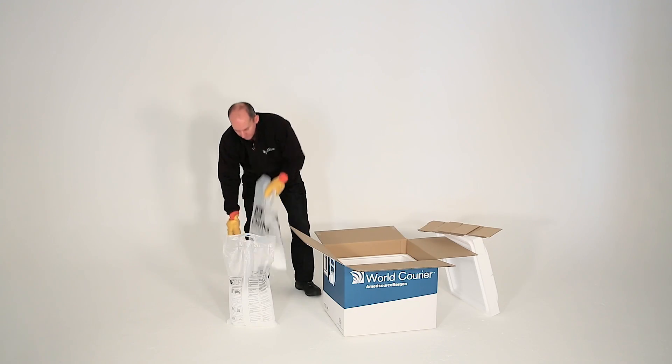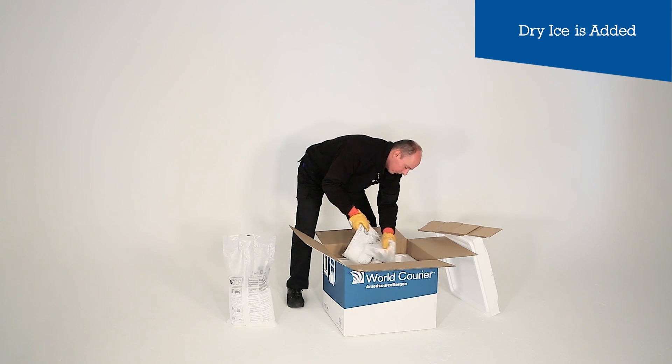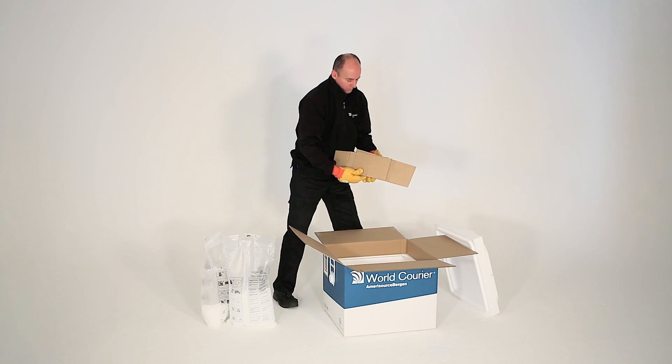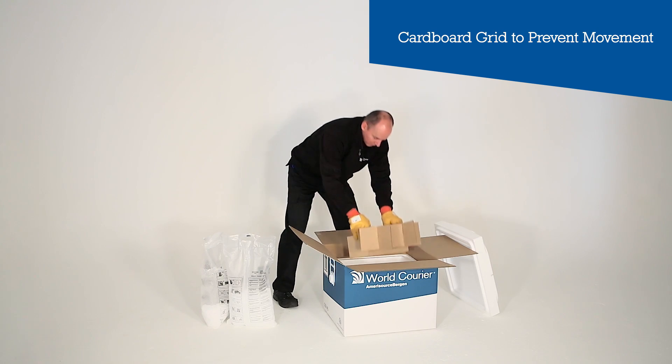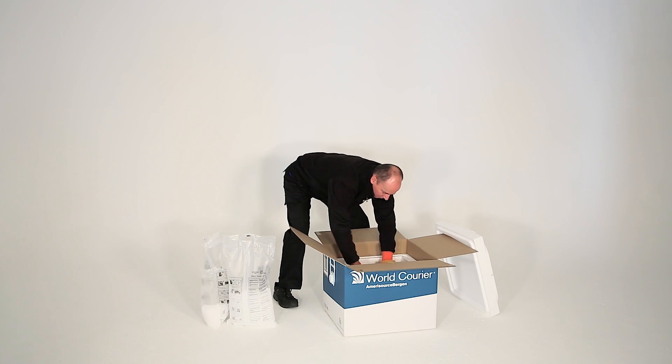We start by adding a layer of dry ice into the polystyrene box, which acts as a thermal barrier protected by the cardboard outer. The cardboard grid is firmly fitted within the box for extra support and protection of your product. The dry ice is held in place by the grid.